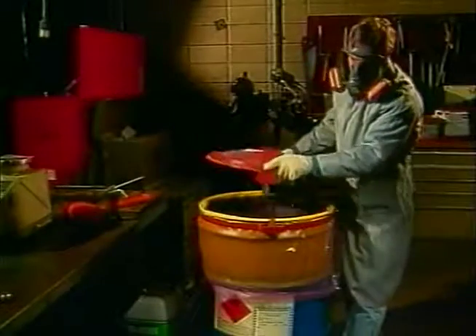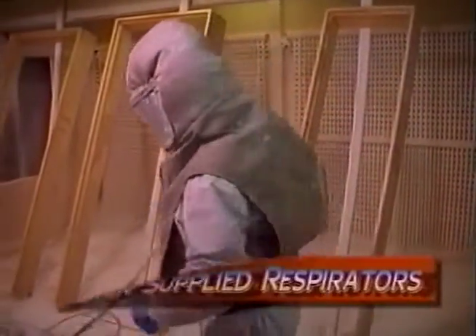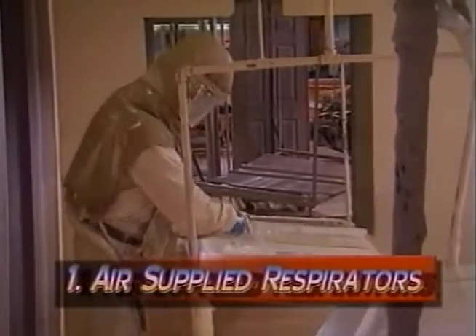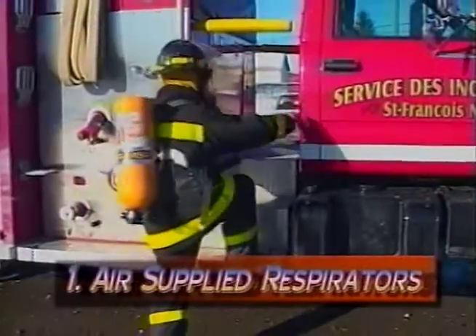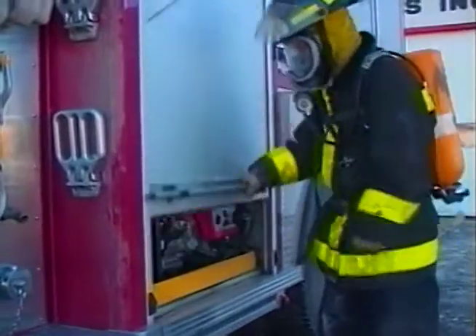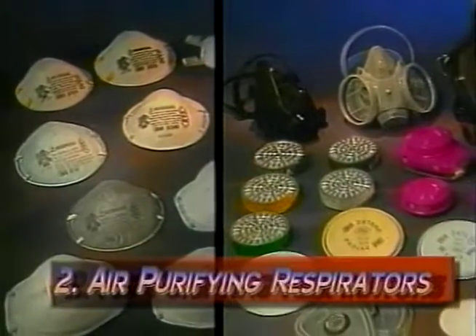There are two main classes of respirators. The first class is air-supplied respirators, where air is either supplied to the respirator by a pump located outside the contaminated area or supplied to the respirator by a compressed air cylinder. This is commonly used by firefighters. The second class is air purifying respirators, which will be discussed in this video.